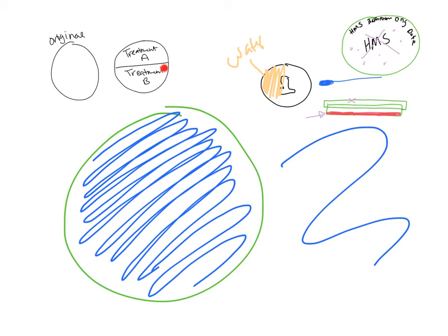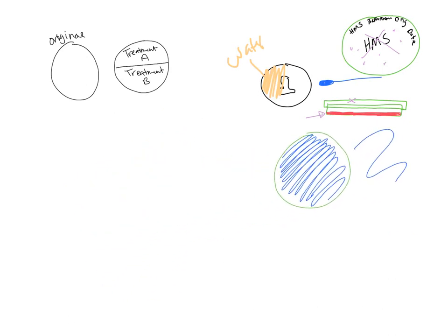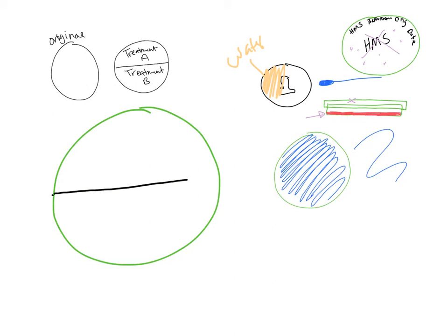So that you know where the split happens, prior to plating on that plate you should split it. Here's your plate that's going to be the treatment plate. You'll literally take a Sharpie or permanent marker, and on the bottom side, the side with the agar, you're going to draw a line approximately across the middle. And that line is where you do not cross when you're swabbing.